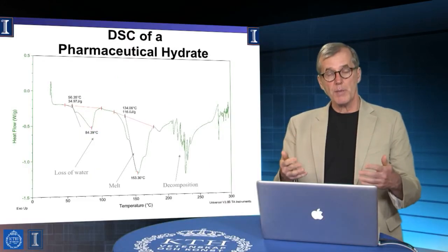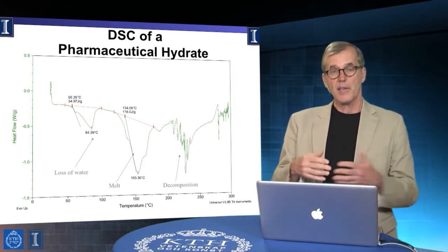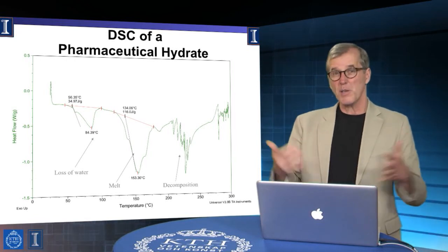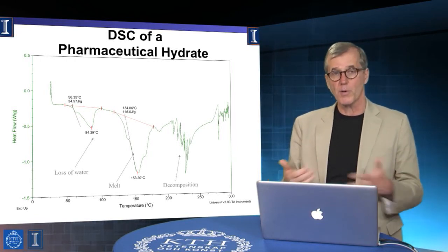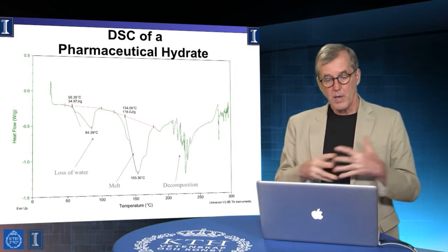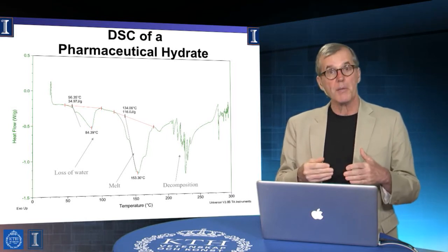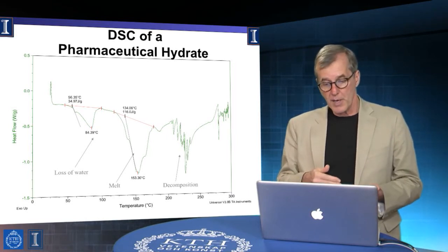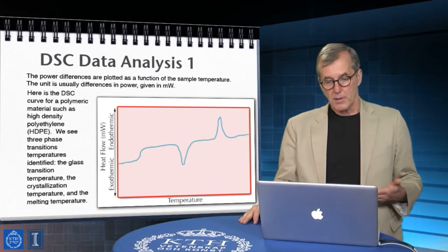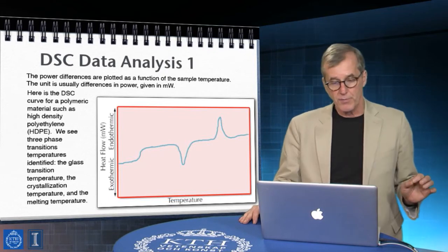And I think most people just take it as a given, and that's a nice thing because it makes it accessible, but it's also a little bit dangerous because it means you don't really know where it's coming from or what it's actually saying, or if the analysis is valid. But in point of fact, these measures can be used to tell you something about the underlying thermodynamics. So these plots, right, are an example. So data analysis. Let's just go through it in simple form, right?